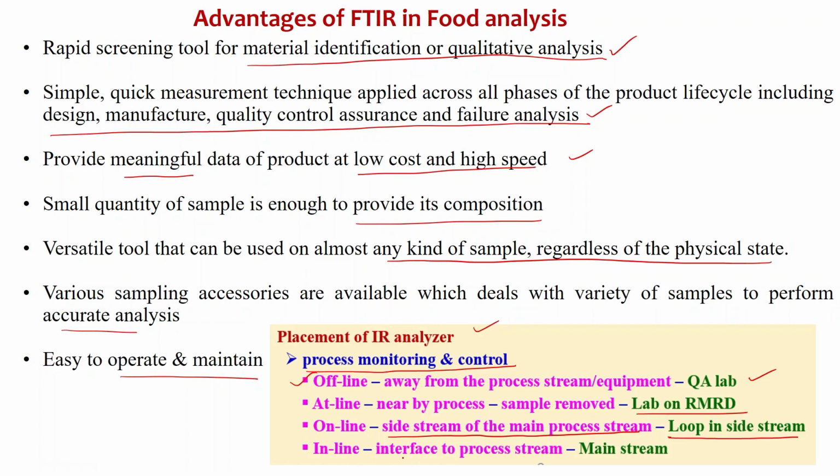Inline means an interface to the process stream, that is, it is in the main stream itself. So we will say that the placement of the IR analyzer is inline. In any of these ways we can place the IR analyzer in order to have process monitoring and control during the processing of the product. Okay, thank you.